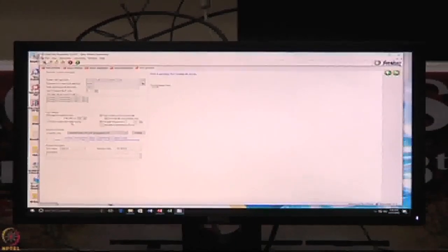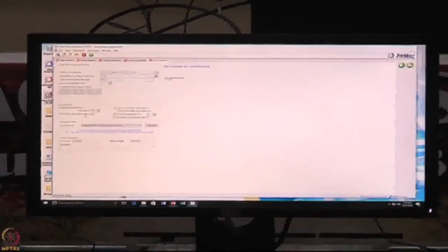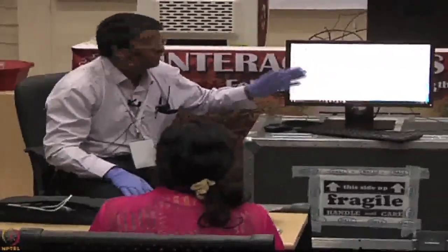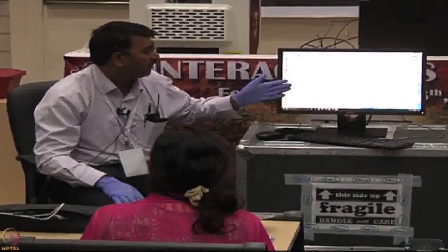So what I did was, during my sample preparation itself, first I started the hydration, then I started the sample preparation. So I saved my time. Otherwise, if you forget this hydration, then you can check in this. So after 10 minutes, the experiment will start. Or if you want another 20 minutes also, you can assign the time, however much you require.